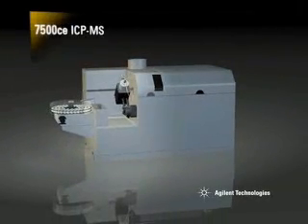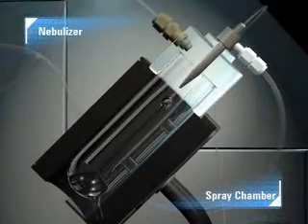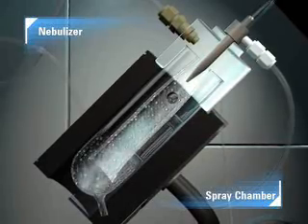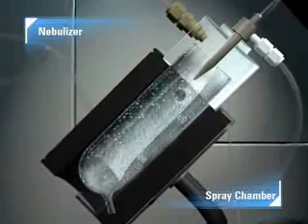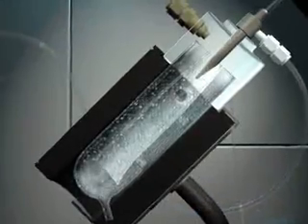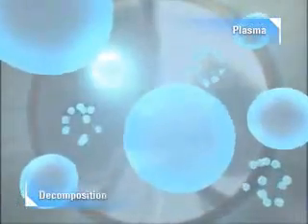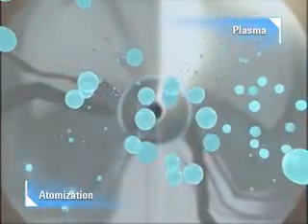Let's follow the journey a sample takes from its sample vial through the ICPMS to the detector. Sample is pumped from the sample vial into the nebulizer, where it is mixed with argon gas to form an aerosol. Larger droplets are removed from the sample aerosol as it passes through the cooled spray chamber, and the fine aerosol is swept into the central channel of the plasma. As they travel through the high-temperature argon plasma, the aerosol droplets are dried, decomposed, atomized, and finally ionized, producing a rich source of positively charged ions.